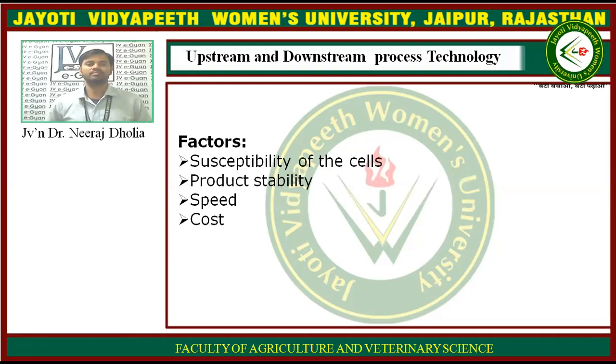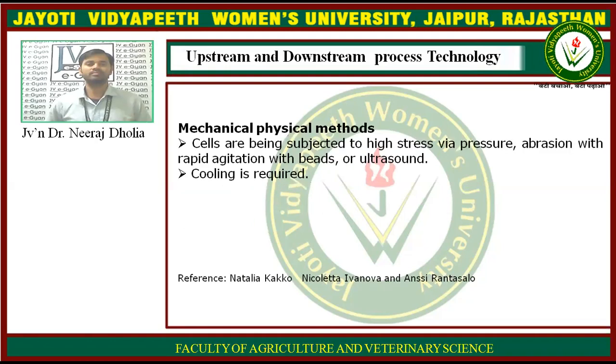So what are the factors that affect the choice of the various methods? They are the susceptibility of the cells, the product stability, the speed of the process, and the cost of the overall production. So let's start with the mechanical physical methods.